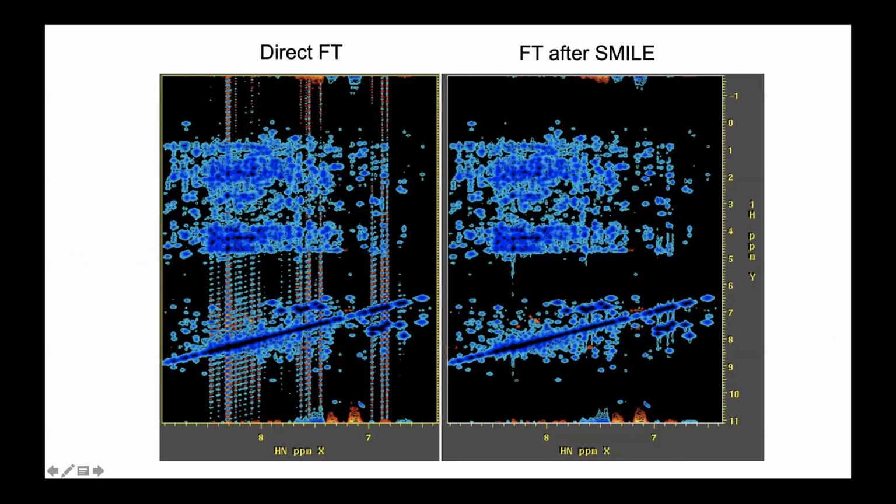And this is directly Fourier transformed without fixing those bad data points. And these are the ones with the bad data points fixed. You see the actual peak is still pretty strong. In this case, it's not my data. It's some other users who sent it to me later.